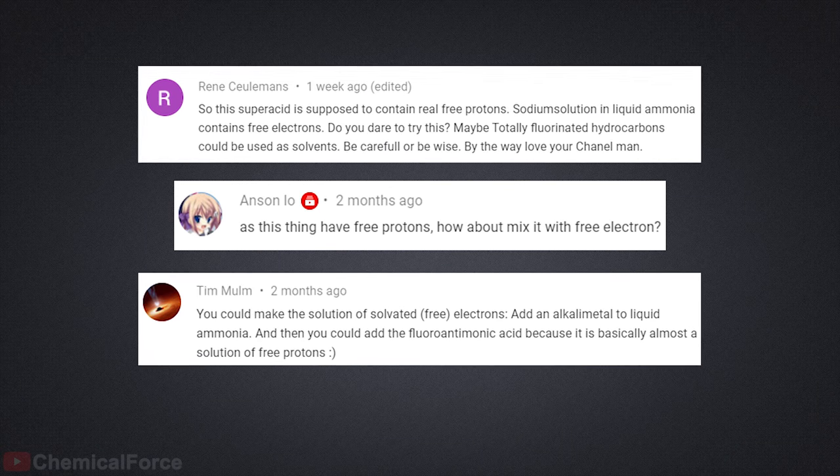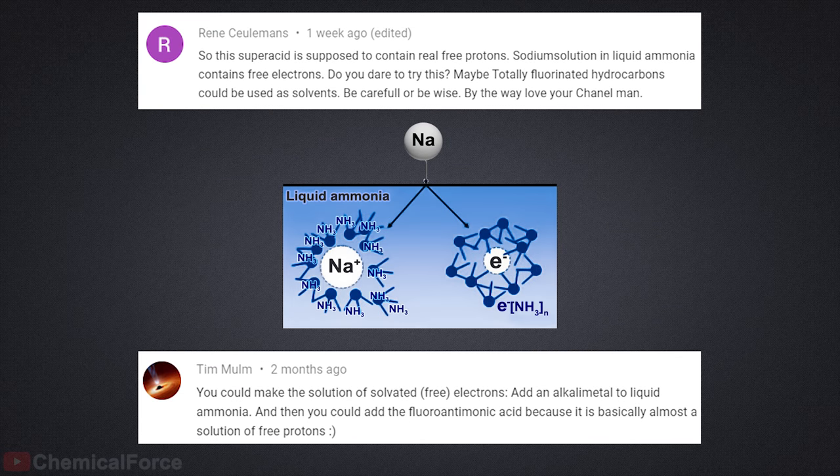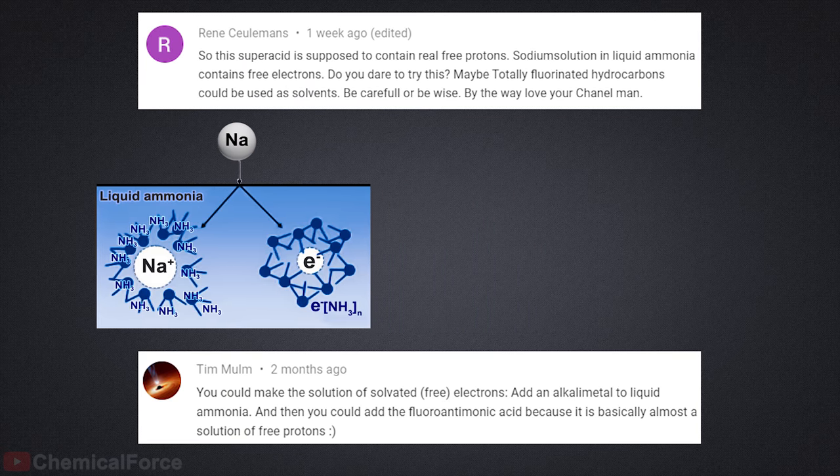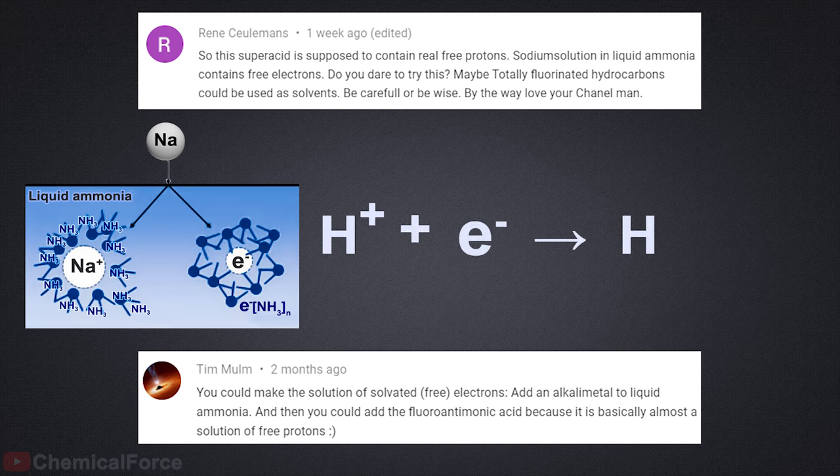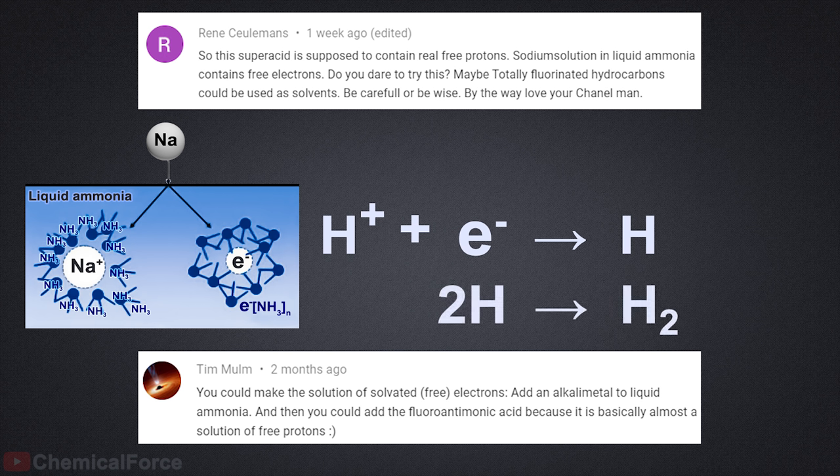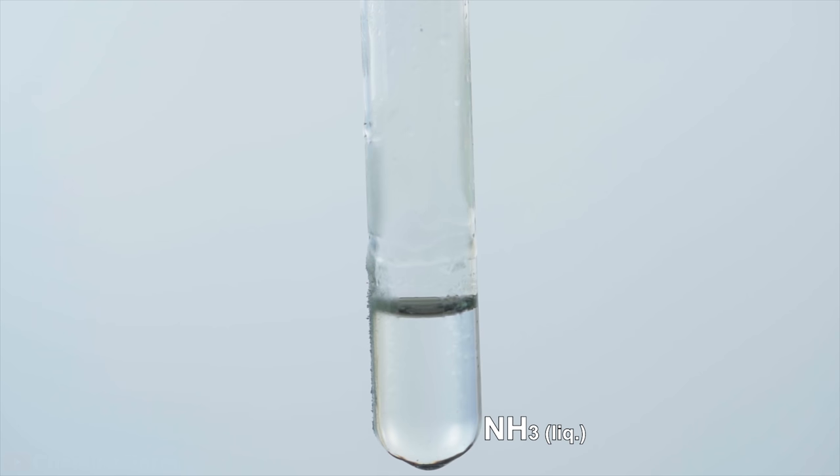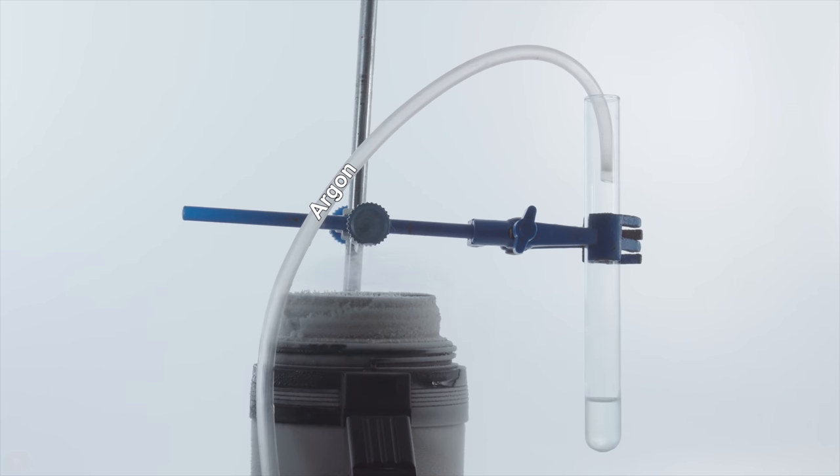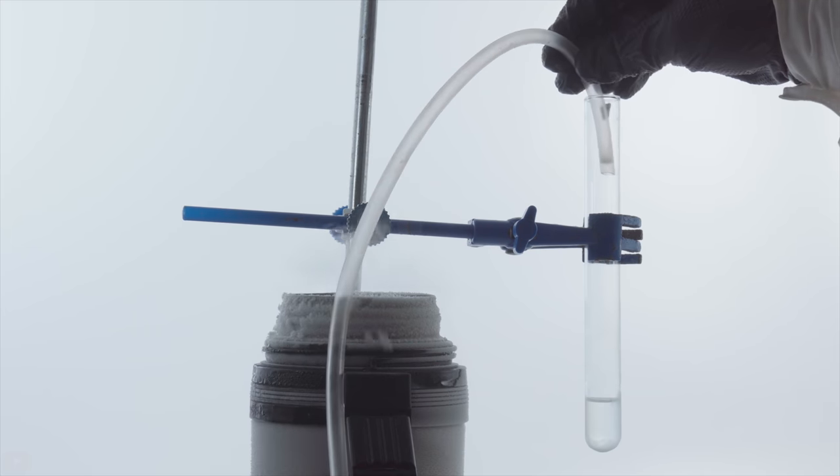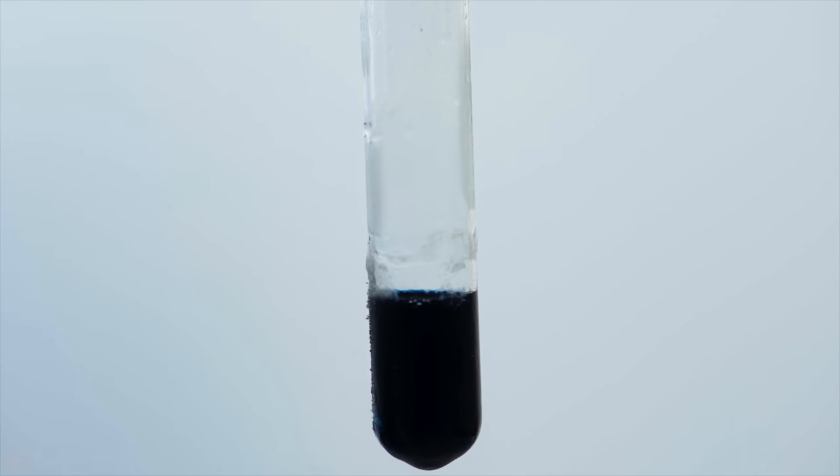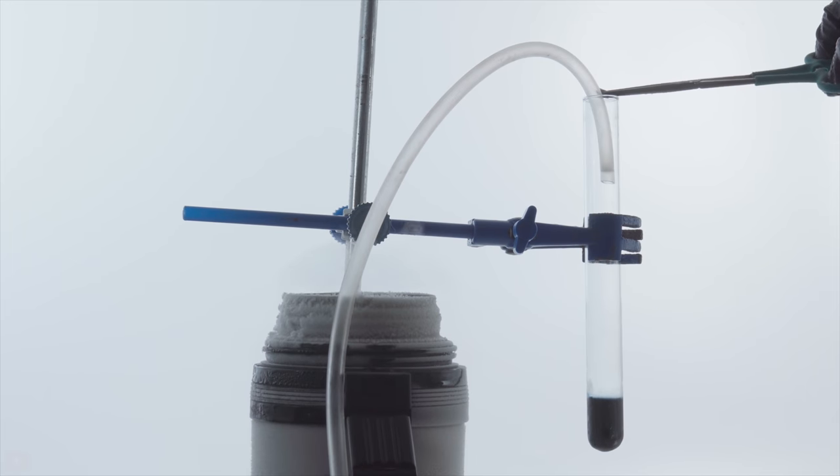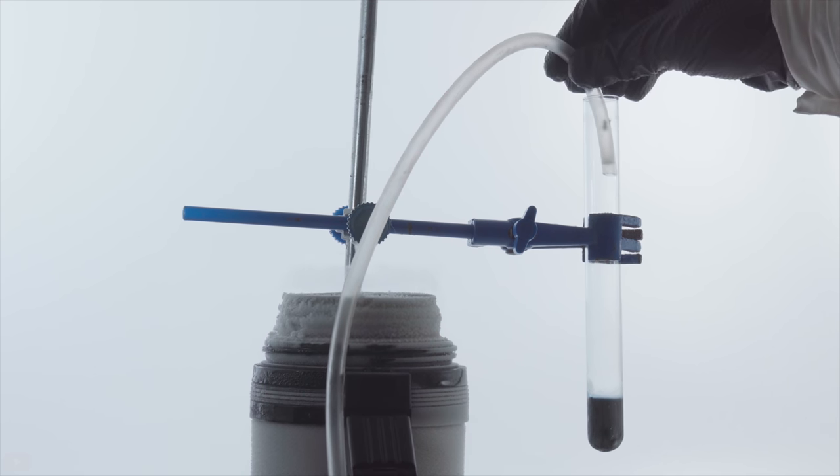And here is one more quite interesting experiment. Roughly speaking, the sodium in liquid ammonia solution carries free electrons. And if we assume that, on the other hand, fluoroantimonic acid carries free protons, and mix sodium in liquid ammonia solution with fluoroantimonic acid, we should get the reaction between electrons and protons that will supposedly lead to hydrogen forming. Well, let's find out if that's what really happens.